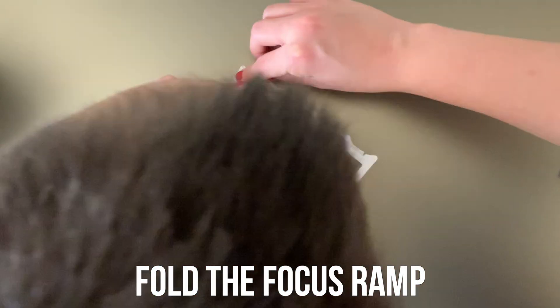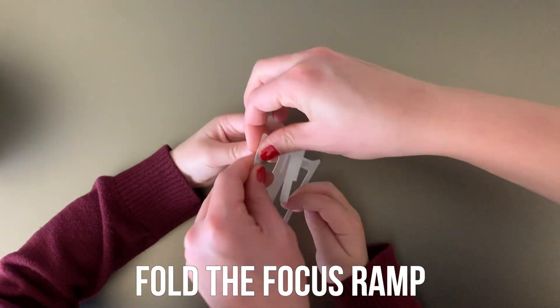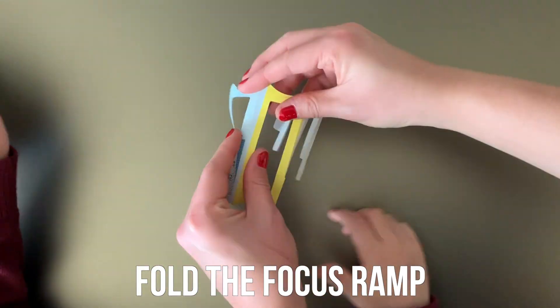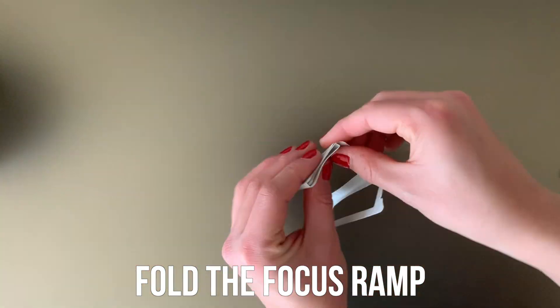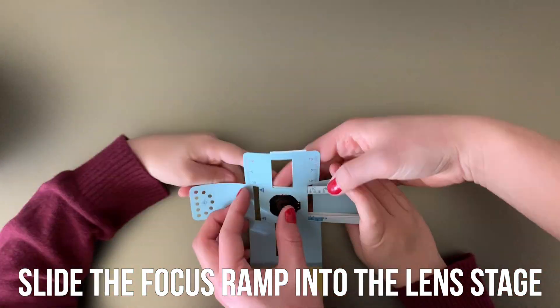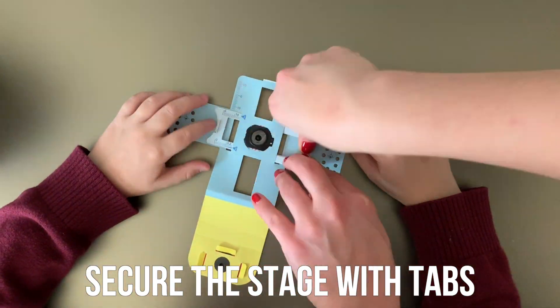Next up, fold the Focus Ramp. Fold all the folds in the same direction in order to create a wedge shape. Then slide the Focus Ramp into the Lens Stage and secure this by folding up the tabs.